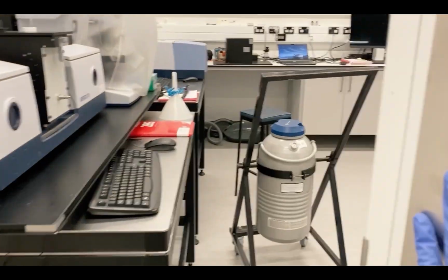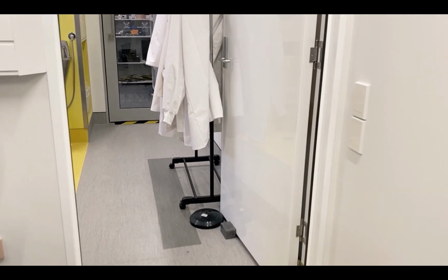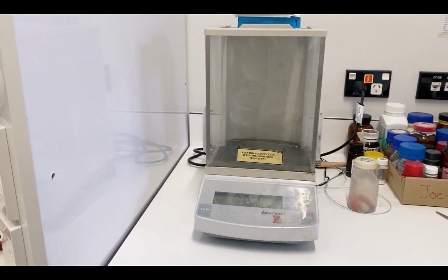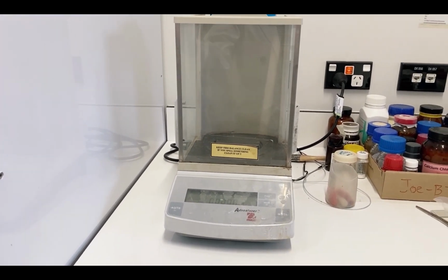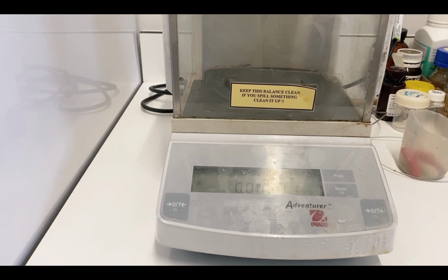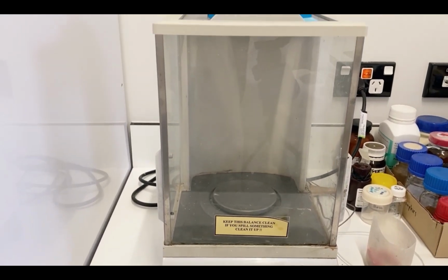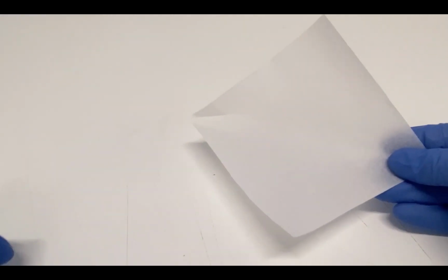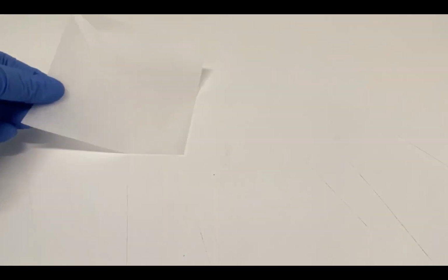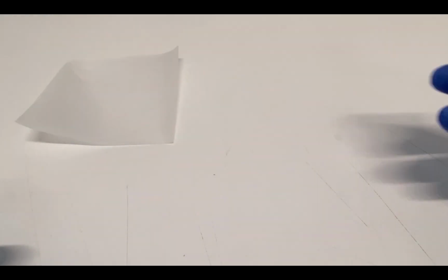So, let's head on to the lab and perform geometric dilution. Here are the materials and equipment needed for this short demo. An analytical balance. This is an enclosed and highly precise laboratory balance that measures the mass with high accuracy, up to 0.1 milligram. Next, we have the weighing paper. It acts as a thin, disposable surface for measuring our powdered substances.